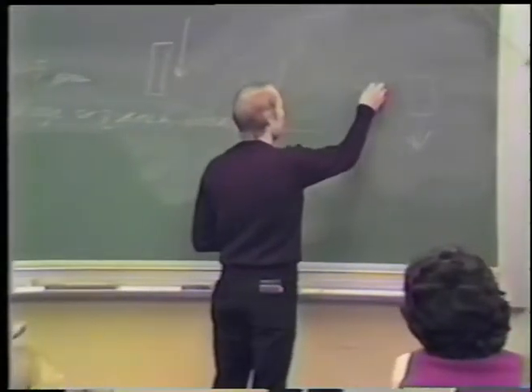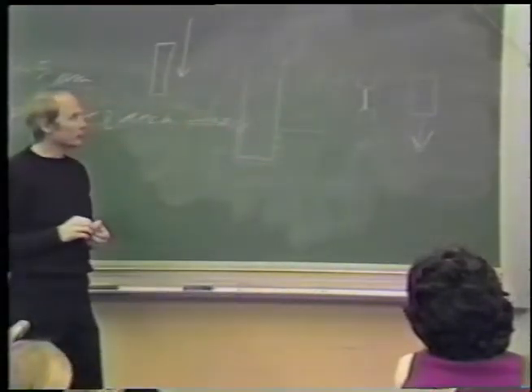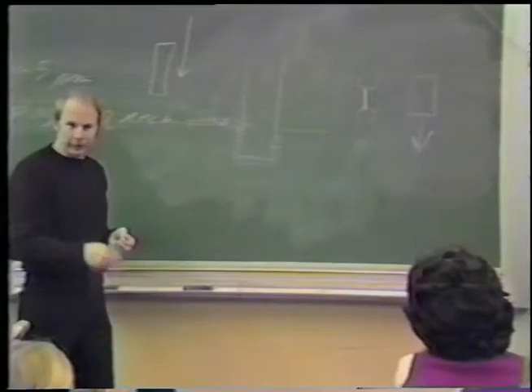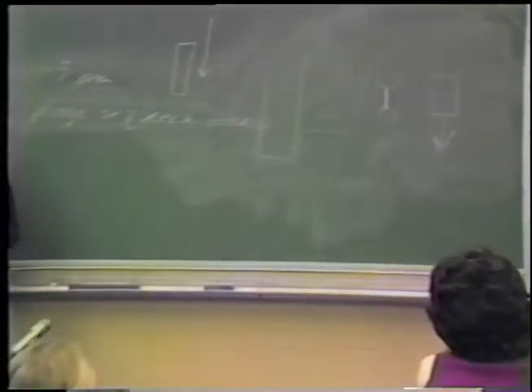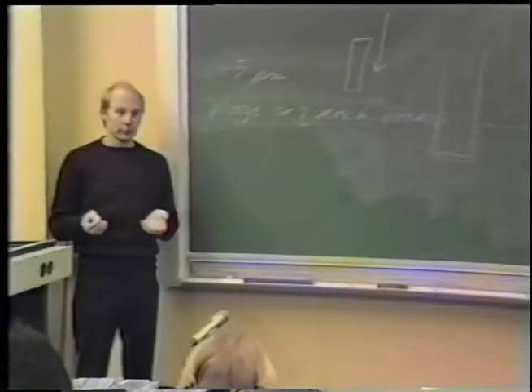Suspensions of cells, you would have to use a sandwich technique. If they are grown on the grids or on a non-conductive surface, you can sometimes hand dip. It's the simplest and cheapest technique, and if your system is small enough, then it's the first one you should try.